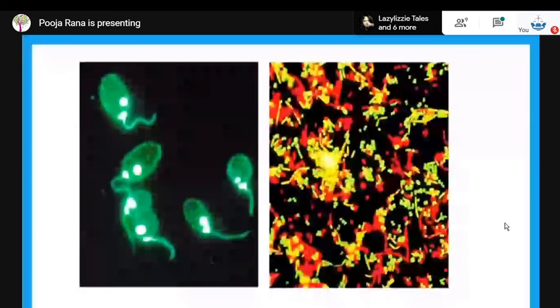Now, when I'm talking about protein structures, basically every tissue contains protein, and if there is some sort of irregularity observed in the tissue, those proteinaceous structures can be visualized. When we go beyond the cellular level, down to the protein level or to the atomic level, we can very well observe those differences using this particular microscope. Fine. So with this, we finish with the microscopy section.